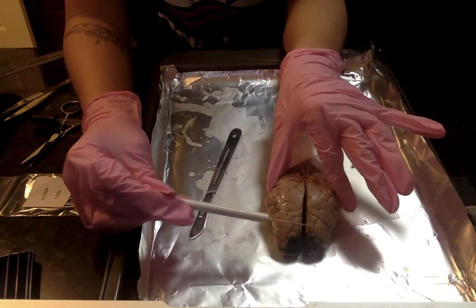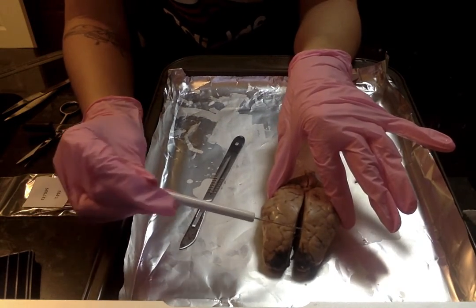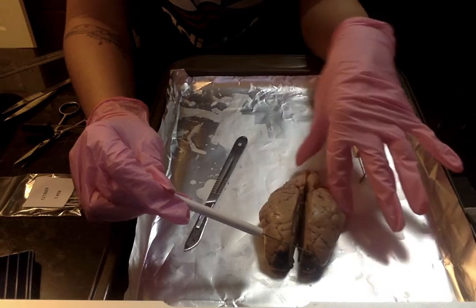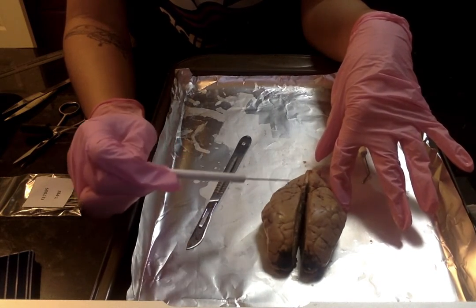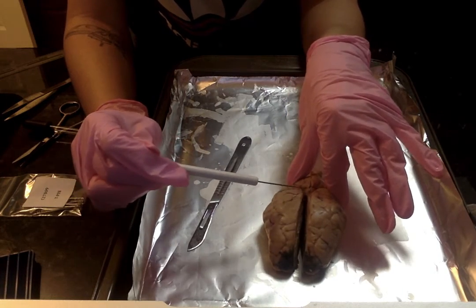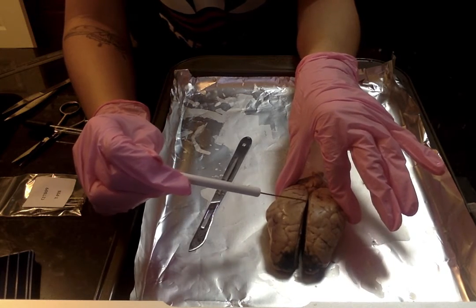The frontal lobe, even though it's not as prominent in the sheep brain as it is in a human brain. But yeah, we have the frontal lobe, and then we have the occipital lobe, which is going to be back here, and then the longitudinal fissure, which is going to be right around this area in the middle.